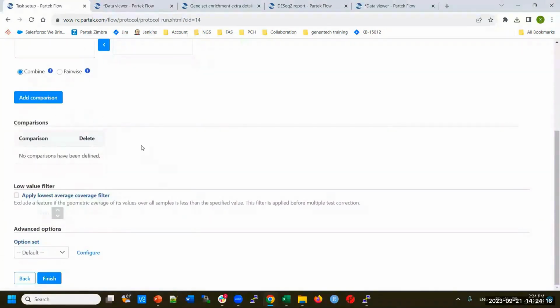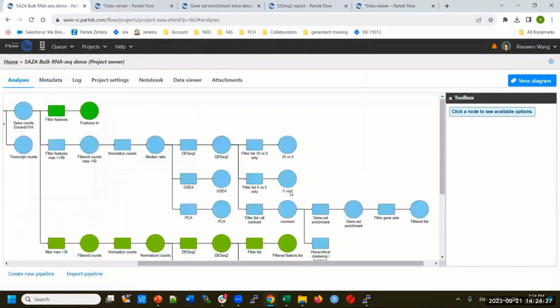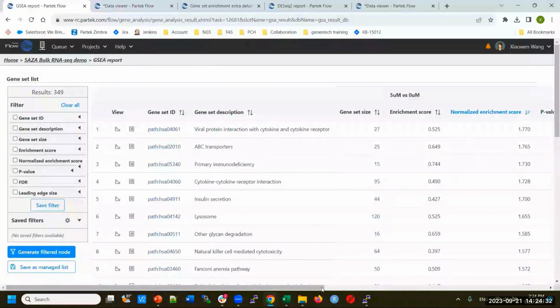This is very much like when you compare each individual gene, but it's a different algorithm. Under the hood, we look up the genes to see which gene maps to which gene set. And then at the gene set level, we look at the differential analysis. In this table, each row is a gene set or a pathway, depending on the database you have.